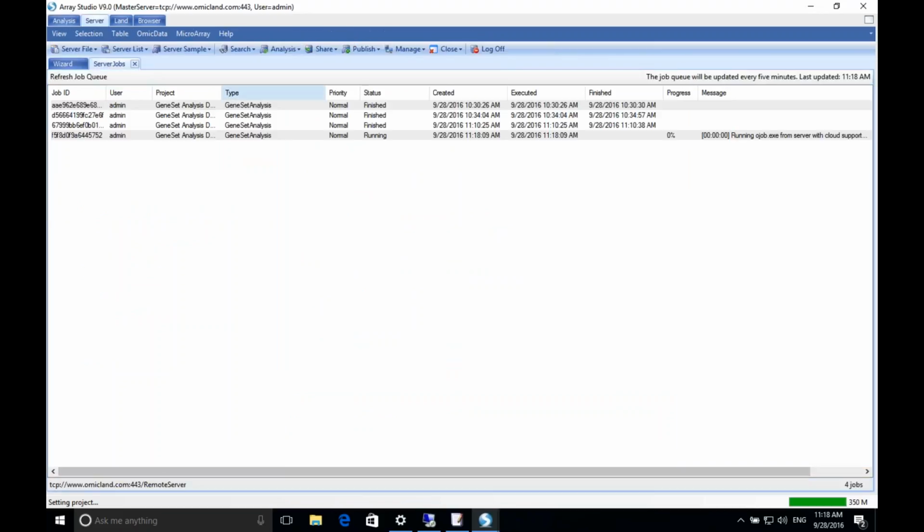And that's going to go ahead and run again on the server. Again, it should take, I would think, a minute or two at the most. You'll notice that it's running on the mouse lands as well. What it's doing is automatically mapping the genes from human over to mouse and then returning the mouse hits as well. While that's running, let's take a look at the lands and see what we're doing here.